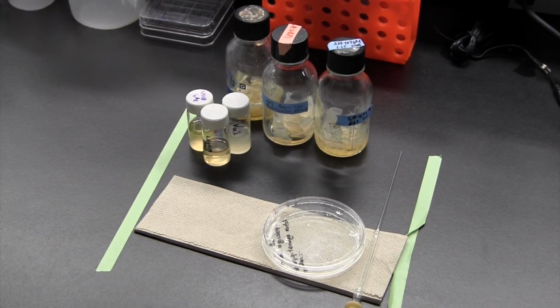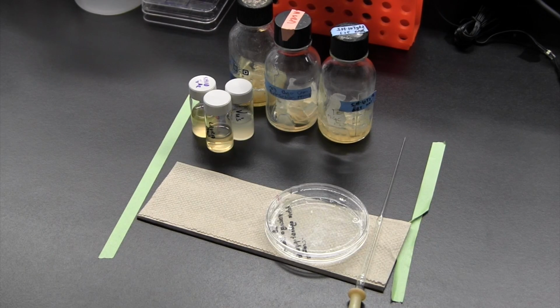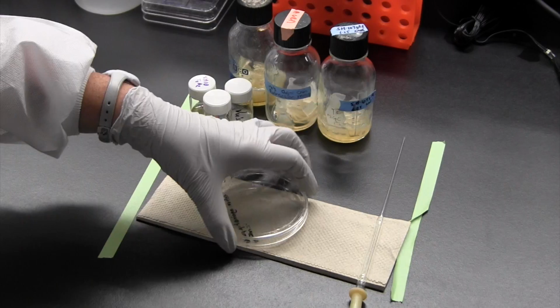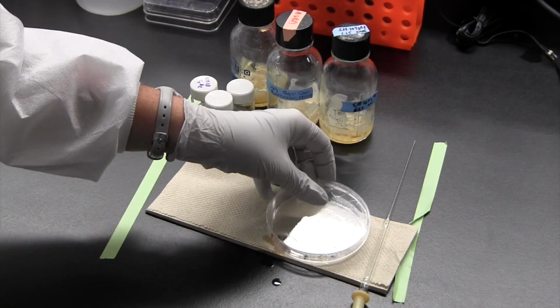Okay, hi, we're just coming into the last phase of our chemical extraction, and we wanted to talk about a couple of questions that come up really often, which is how do we get rid of all this stuff that we've generated? So just to walk you through, you've had your bacteria growing on a lawn in agar on a plate. So this plate obviously is going to go into your biohaz waste in your lab.